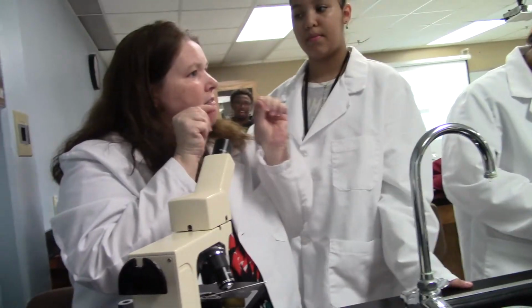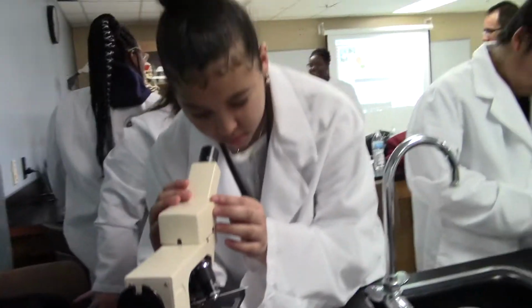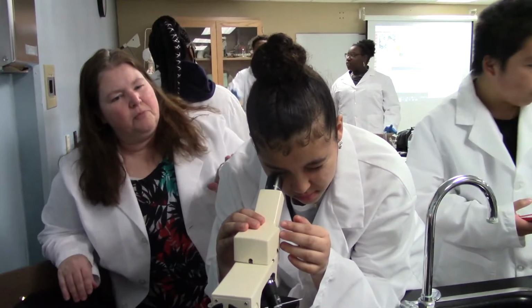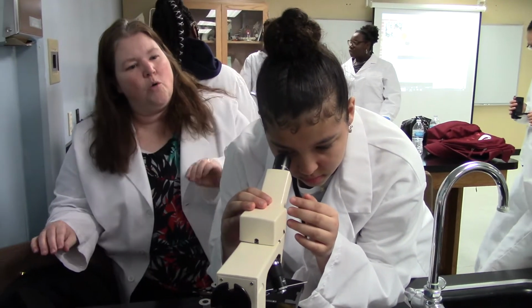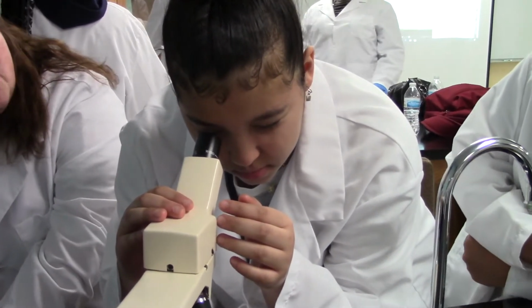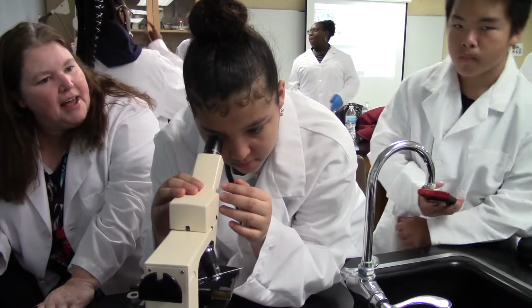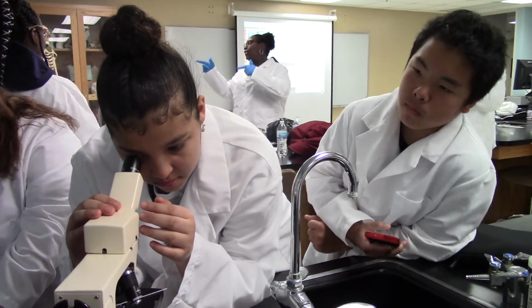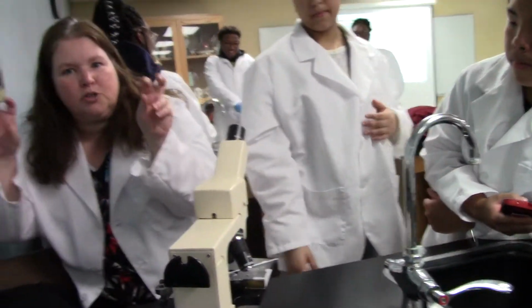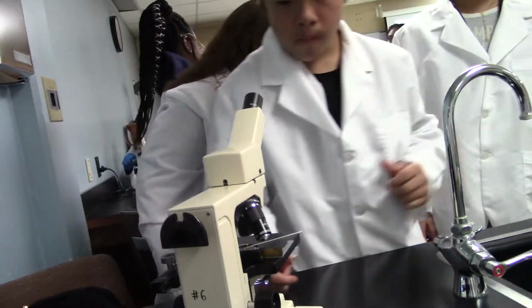You can focus in on one part of his body, and then look for that contraction, right? It's not good to look at the tail because a lot of times the blood doesn't go all the way down to the tail. You see it? So if you want to count, you just have to have somebody ready to time for 1 minute, and you're going to count how many times you see that muscle push and contract in 1 minute, and that's his pulse rate for 1 minute. You want to see it? Or he's going to count and you're going to time?